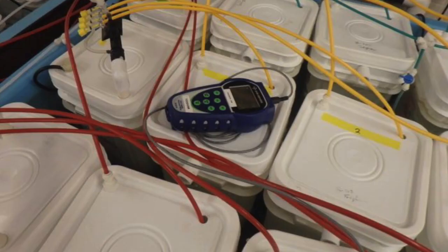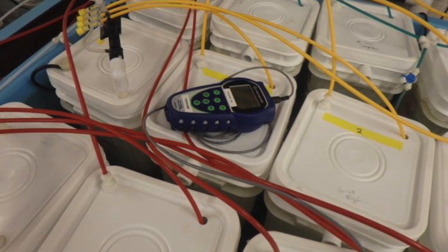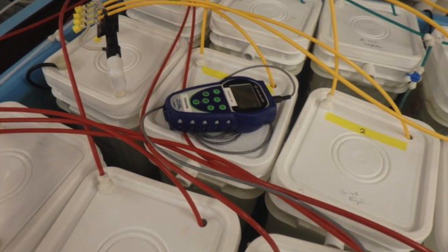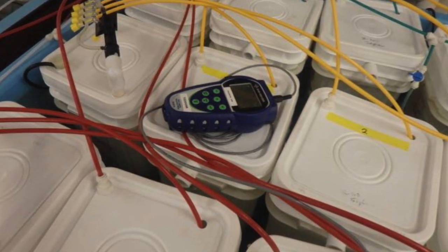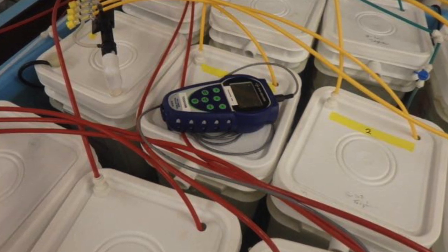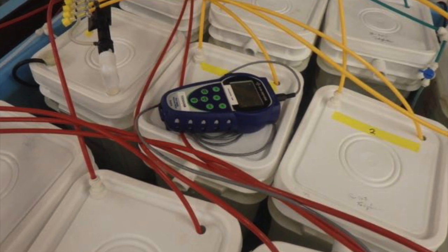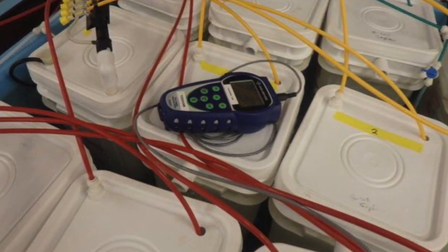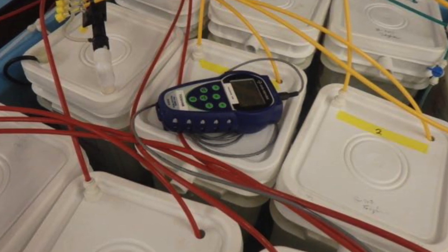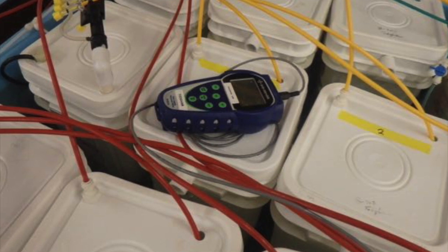Because this experiment involves 3 variables, temperature, carbon dioxide, and time, we need to set up a complicated matrix of tanks. First, there are 2 big tanks that are each set at a different temperature. Then, within those temperatures, there are 6 sub-tanks with 2 different carbon dioxide concentrations, 3 of each. It is important to have 3 buckets of each condition to rule out any effects caused by the bucket itself. Each bucket holds 37 fish. We need to have that many fish for the data to be significant. Dr. Todgham adds a few extra fish to each tank just as a precaution.